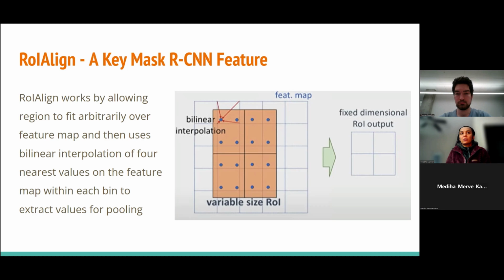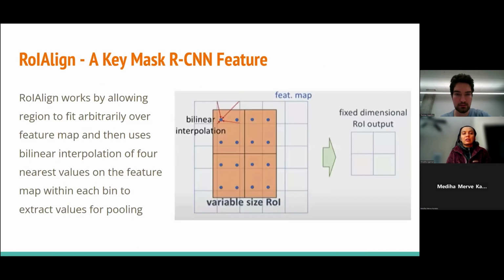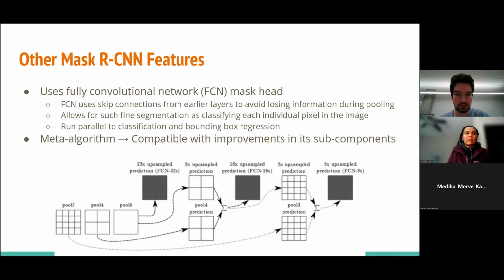So in Mask R-CNN as an output, are you getting the bounding box as well, or are you just getting the masks? Yeah, you're getting both. I think I said that at some point. You're having three things: the classification, the mask, and the bounding box. Depending on what you're looking at, the bounding box may be kind of obsolete or gratuitous if you already have the mask, but it might be useful in some instances. Even when I was talking about automated GB analysis, you kind of want the exact position or the relative position of each dislocation compared across images. So it could be useful in a context like that, to have that bounding box, especially if it shifts slightly.